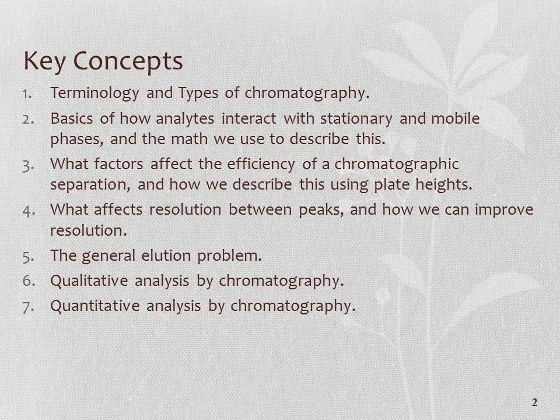I'll try not to focus on every step of the math, but on some of the most important things. With these fundamentals comes the concept of what a plate height is to describe the efficiency of separation, and also what the resolution between two peaks is. Finally, I'll wrap up with a few comments about the general elution problem and about how we can do qualitative and quantitative analysis using chromatography.